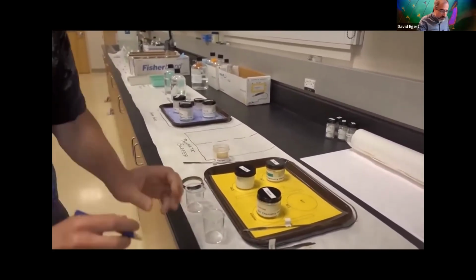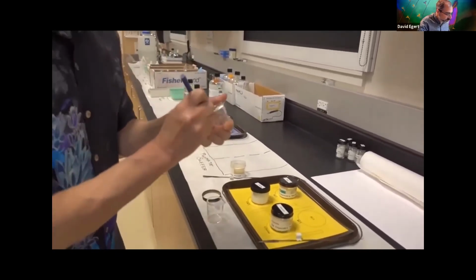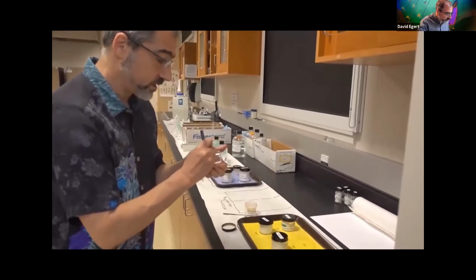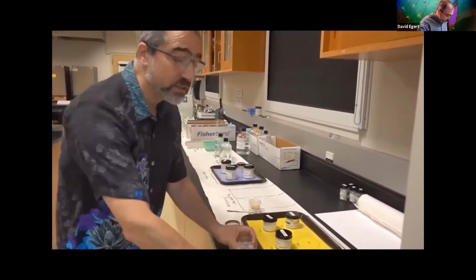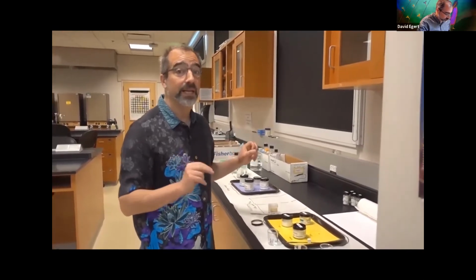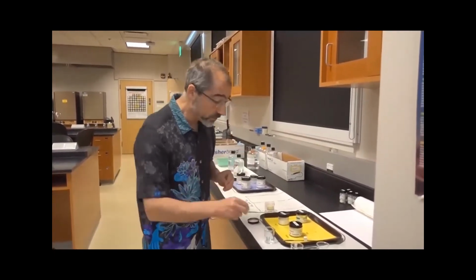I'll use a pencil here, and I'm going to have some potassium chloride, and a calcium chloride. That's another thing. In a lot of these labs, you're going to have very similar looking tubes or beakers with different stuff. It's another place where you want to get pedantic and be good about your record keeping and marking what's what so you don't get confused about things.